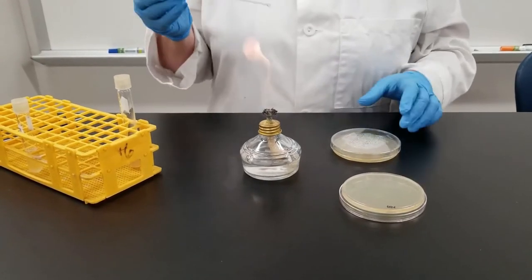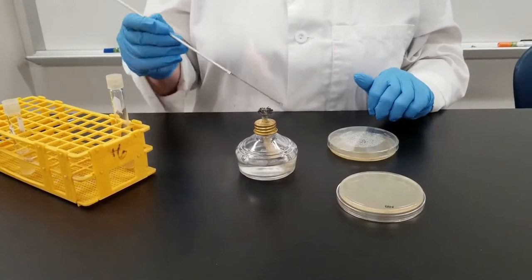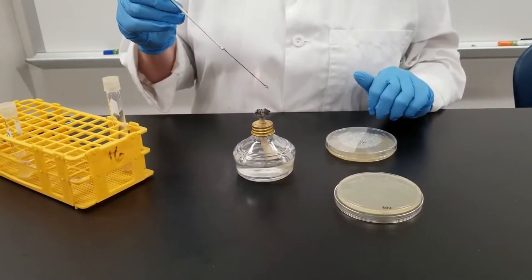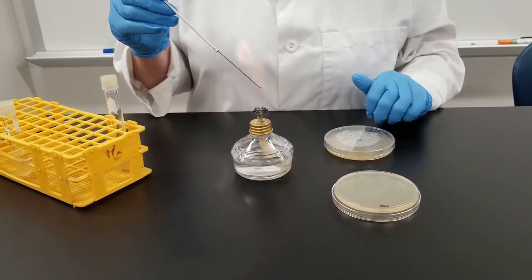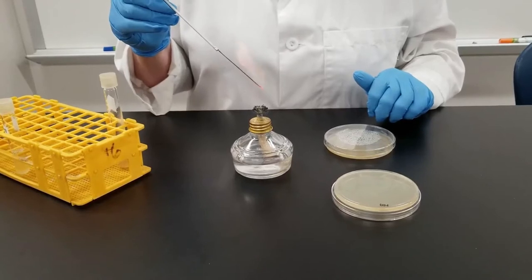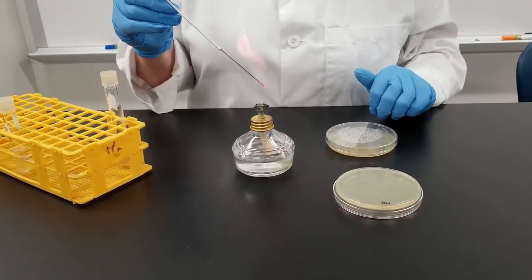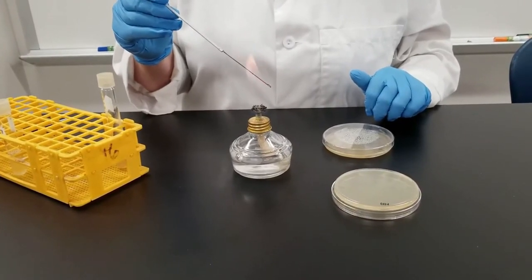What you need to do to start off with is take your inoculating loop. In this case, we are using the loop. You need to stick it into the flame. This is an incineration. It is a way of sterilizing that loop. You're literally burning everything off. You want to get it where it's glowing nice and red that kills everything that has been on this loop.